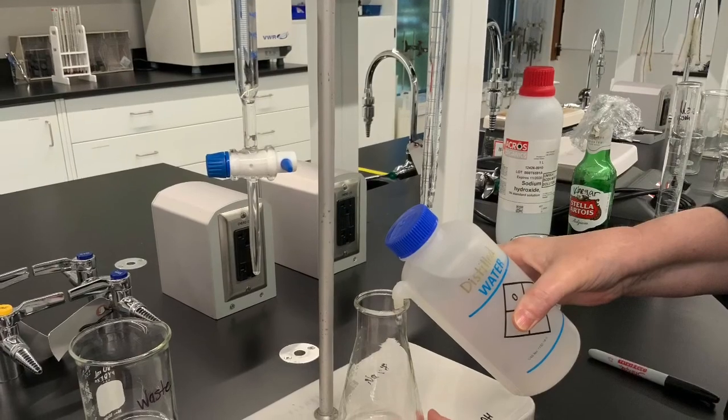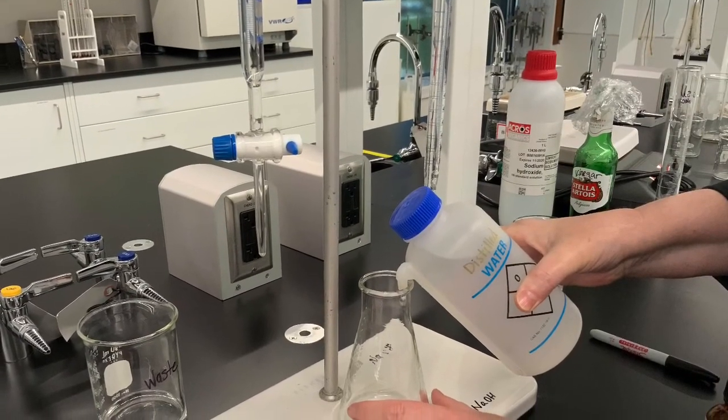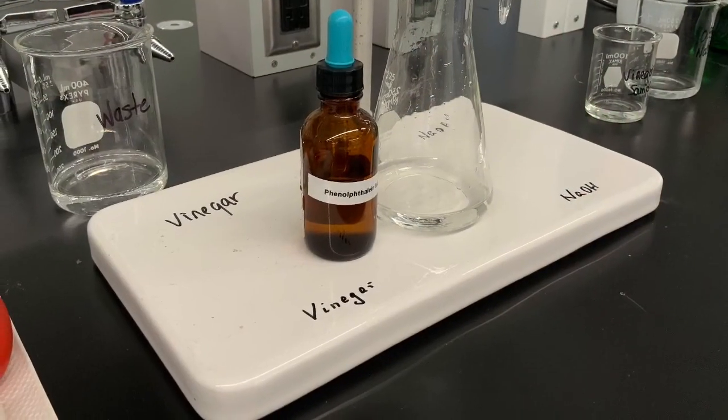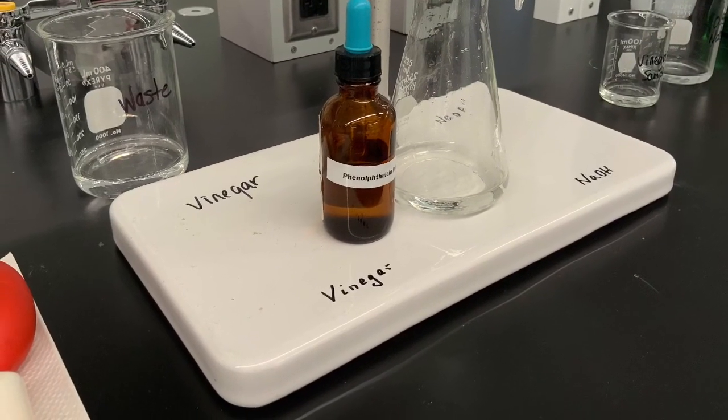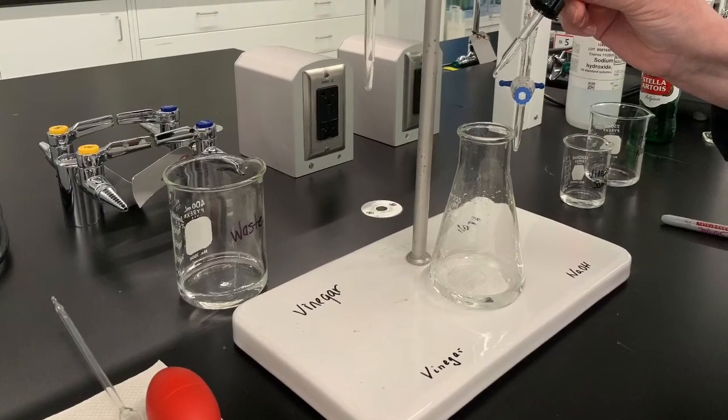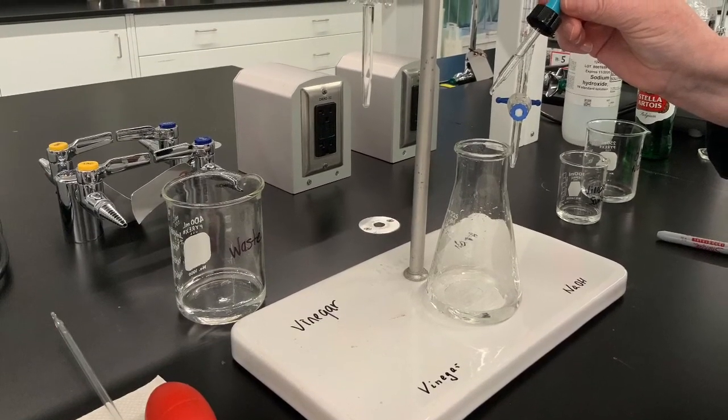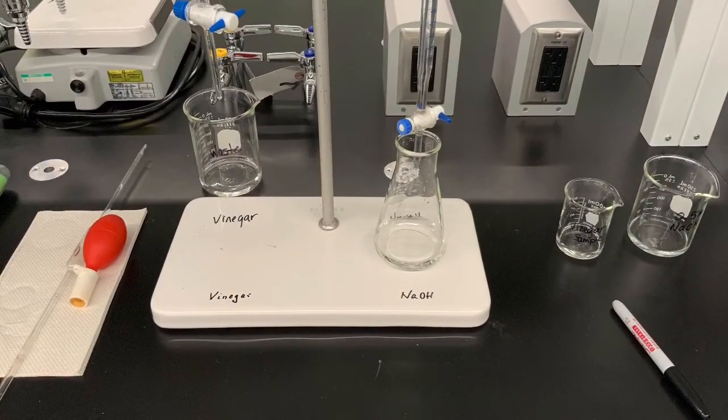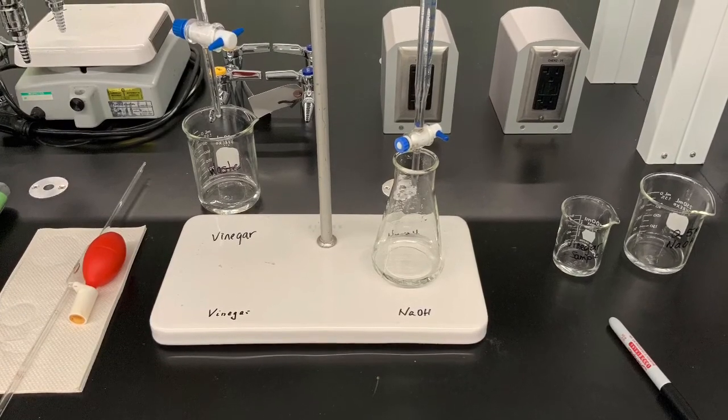Adding some distilled water and a couple of drops of the indicator phenolphthalein will get the vinegar solution ready for the titration with the sodium hydroxide solution.